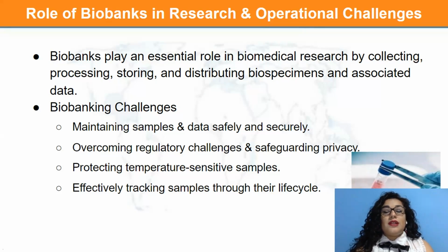However, logistically speaking, this could be a nightmare because all the samples and data must always be kept safe and secure. So the staff must be capable of ensuring their own safety, protecting the privacy of donors, and demonstrating their competency. So biobanks must comply with regulatory guidelines.